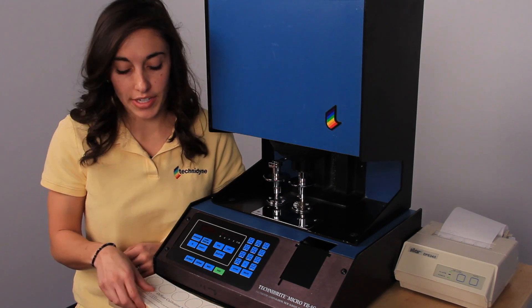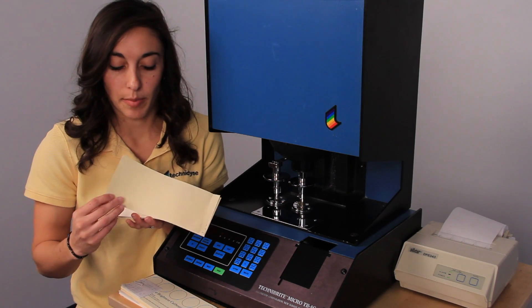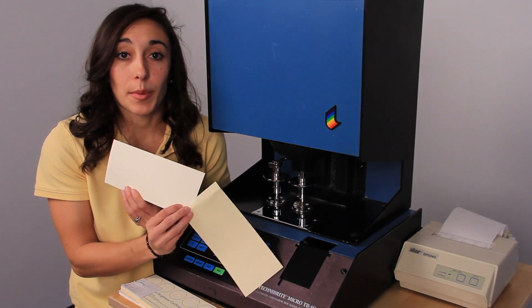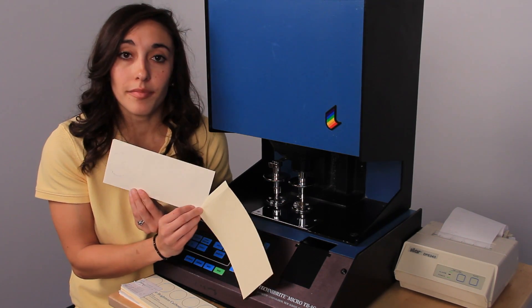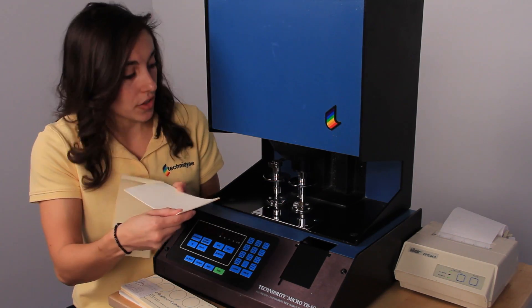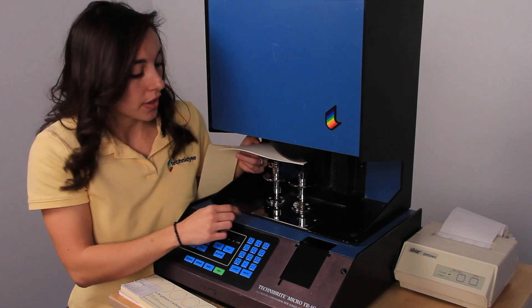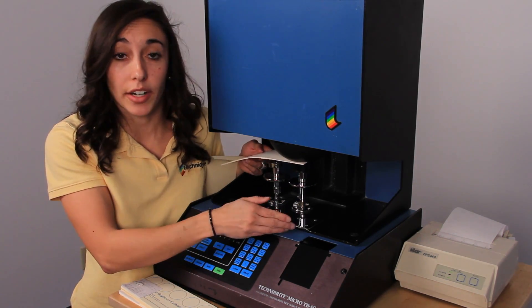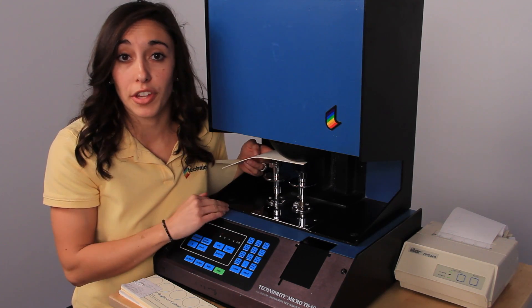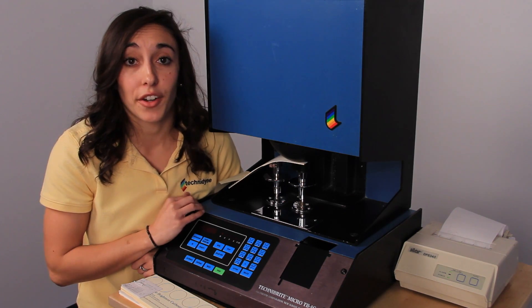Our next step is to load our standard. We're going to fold back this back cover sheet to expose our calibration standard. Since we're calibrating to the first position, we're only going to load it just to this front edge. We'll load our standard, and you can use the chrome plate as a mirror just to check the alignment and make sure that you have everything positioned properly. Once you've loaded your standard, you can press scan.